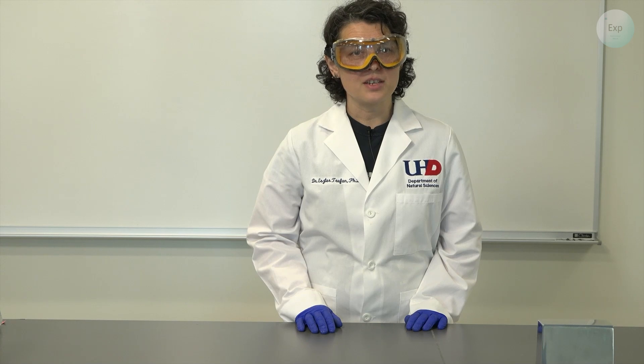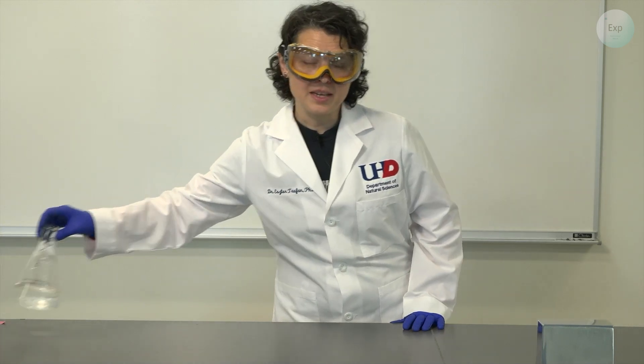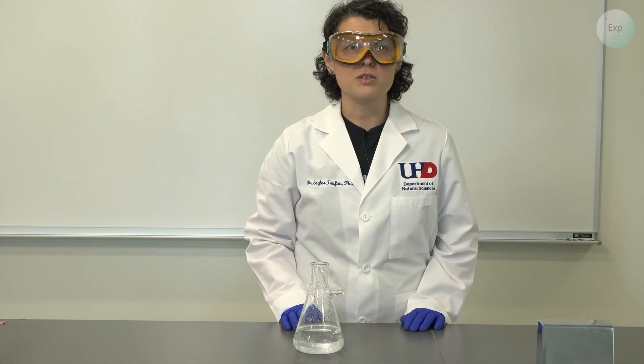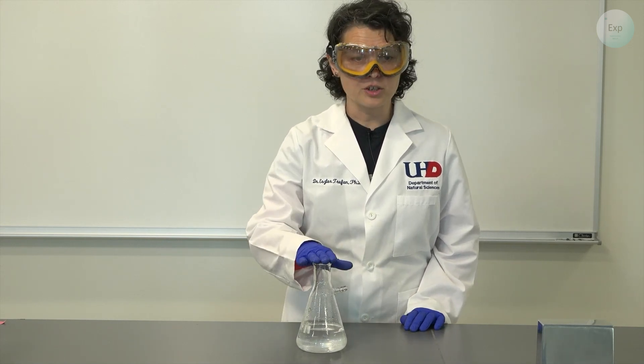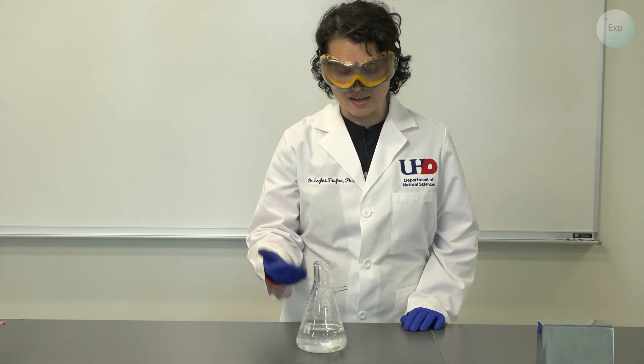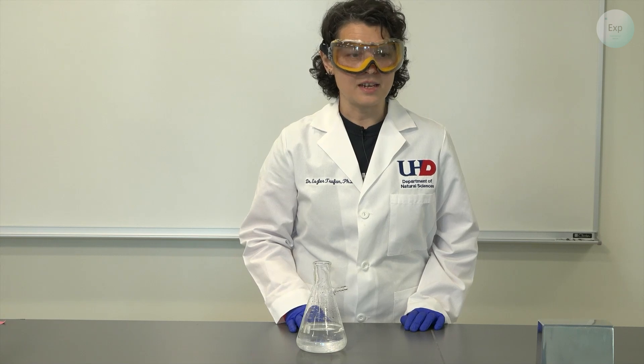The first thing you need for this setup is a saturated solution of the compound that you want to grow crystals of. Here I have my filtered alum solution and I know it is saturated because I removed all the little crystallites from it.